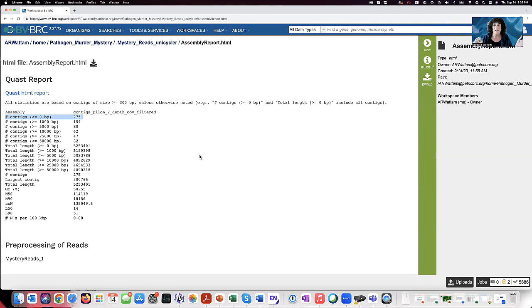So if it was something like 5,000 contigs, and believe me, I've seen those before too, that's where I'm starting to say, I wouldn't do it. Actually, anything over 1,000 contigs makes me worry, and I don't really look at those in the analysis. And then I also look at the longest contig. So not great, but not bad. It's not up in a million base pairs, but okay.